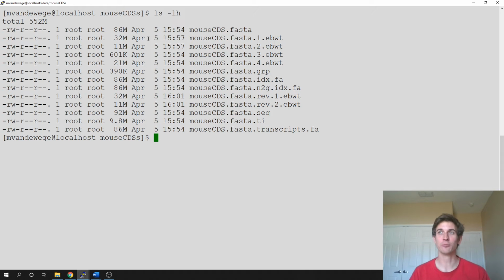And whenever we're dealing with transcripts, there are two major things that we care about in a transcript. What gene is there and how is it expressed? The second question is more or less what we're addressing today. So we've already played around with what genes are there, but now we're staying in the same world. We're going to keep using the data that we've already generated and cleaned up. That's why I was so persistent about getting y'all to do it. So you have these clean reads because we're going to use them again to measure expression.